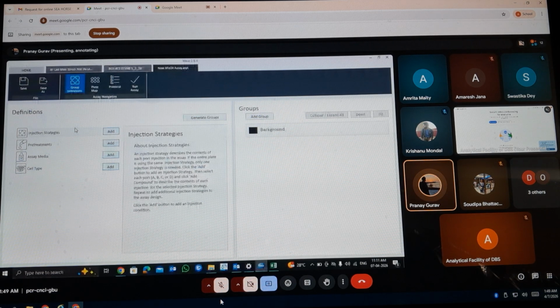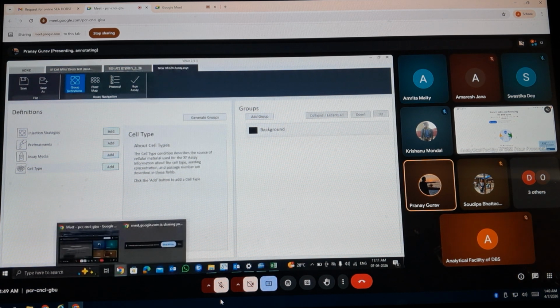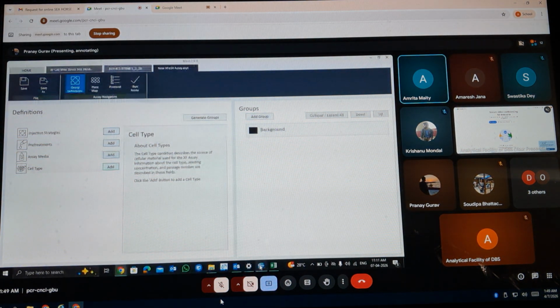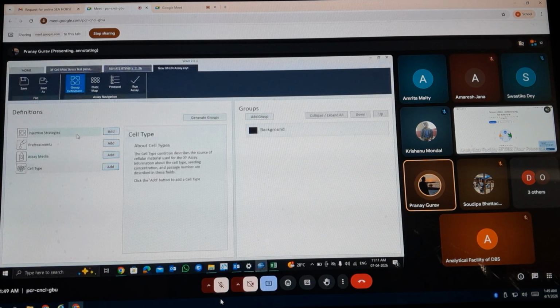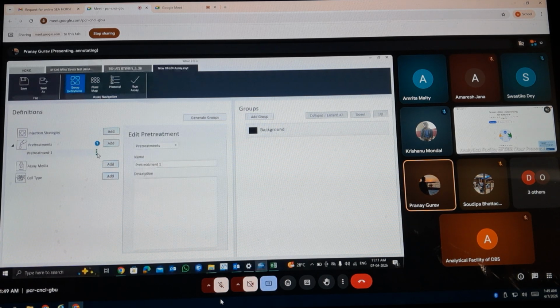You just don't have to define... Hello, can you hear me? I have already opened one. No injection setting.